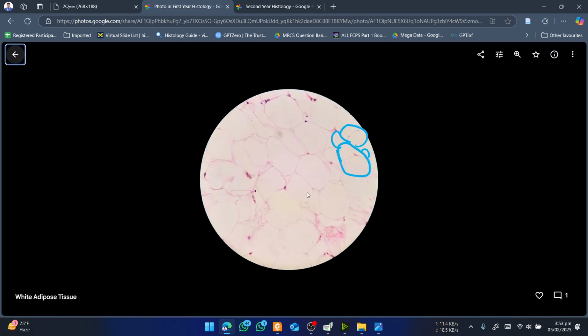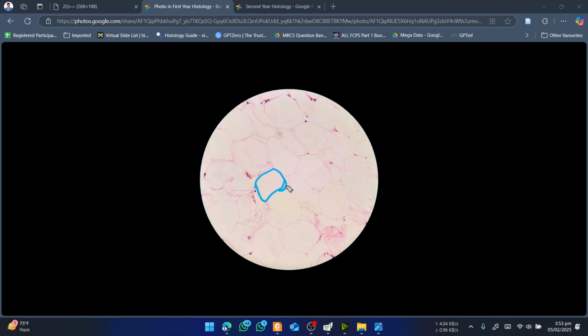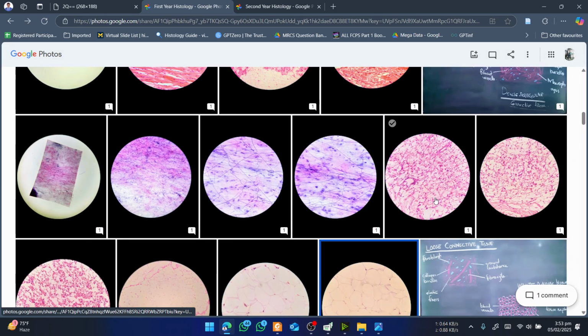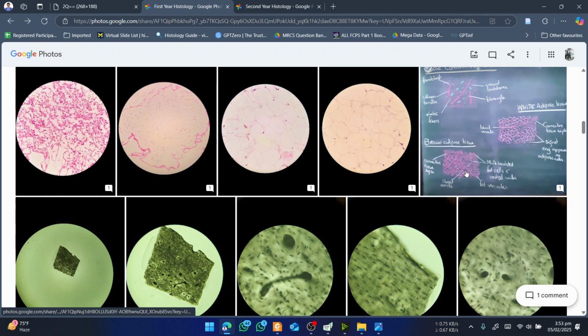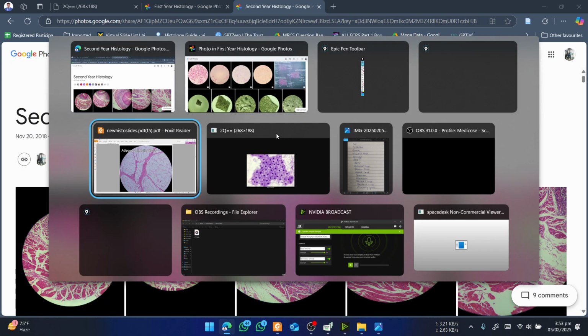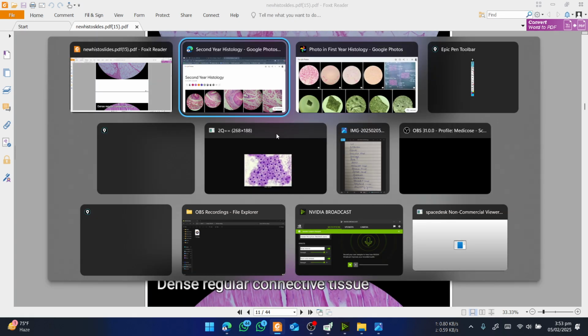You may see something like this too. Sometimes when it is very light, it seems like this. So this is one cell, and it is signet shape appearance because this is a ring with that is its nucleus, or the diamond in the signet ring. So that is the adipose tissue. Brown adipose tissue has very small loculi, but I don't have a very good picture for it right now. So I can show you, but I don't think you have that.